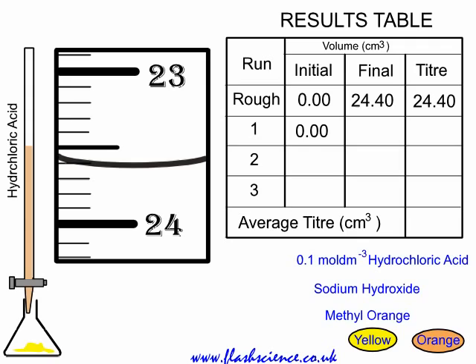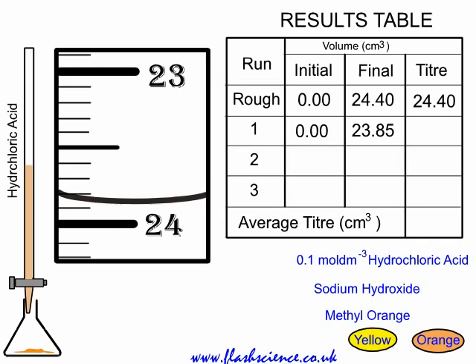It may turn from yellow to orange but go back to yellow again at this stage. Lots of shaking is required, and you want to add just enough to make it go orange and stay orange. Look at the titer there — it's halfway between 23.8 and 23.9, so 23.85 is recorded as the final reading. The difference between the initial and final is the titer, so the first accurate titer is 23.85.